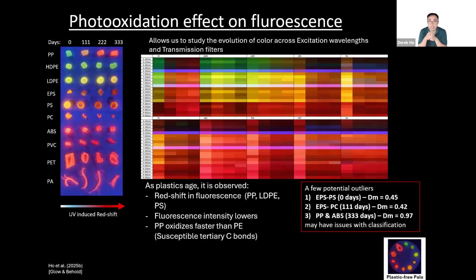Additionally, fluorescence intensity tends to lower, and some plastics will have different rates of oxidation. So we have to be quite wary of how we study weathered plastics.